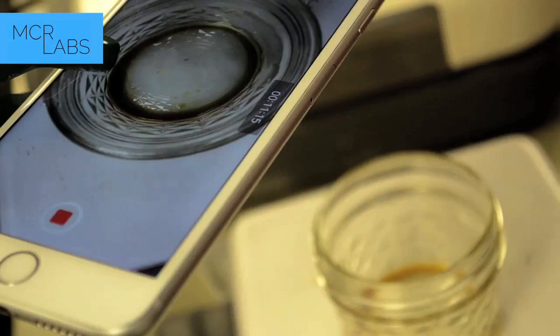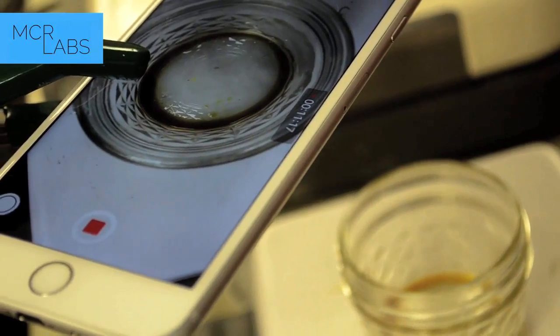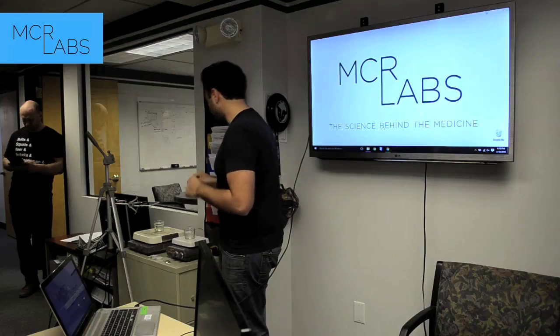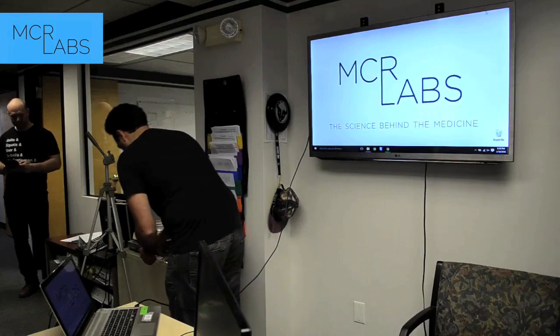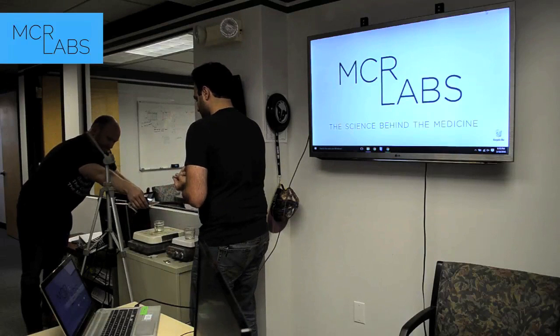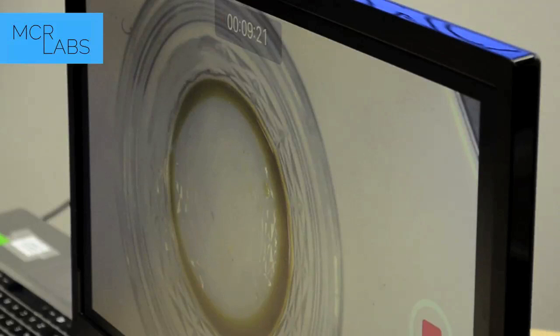So I did the experiment earlier. We got a really nice reaction here and a slight reaction here. So I'm going to start them up. I have about a ½ gram each. And Yash is going to live stream this onto this monitor right here so we can actually see what's going on. You have to make sure that you've applied heat at some point for the right amount of time and at the right temperature and in the right conditions to achieve decarboxylation.